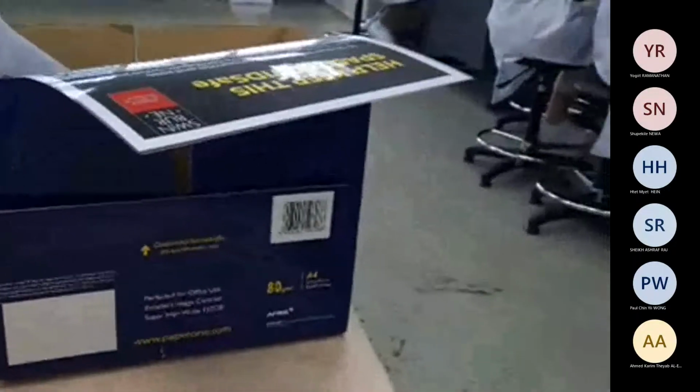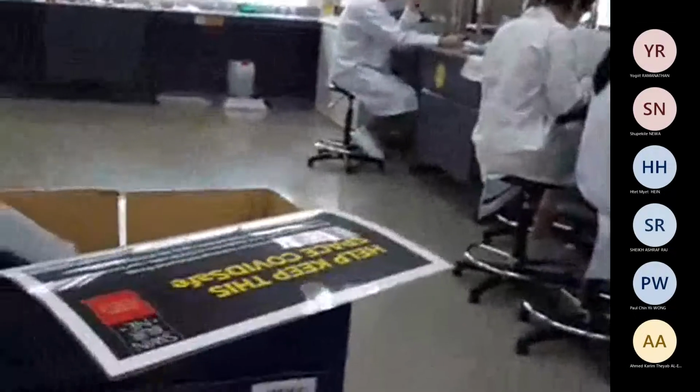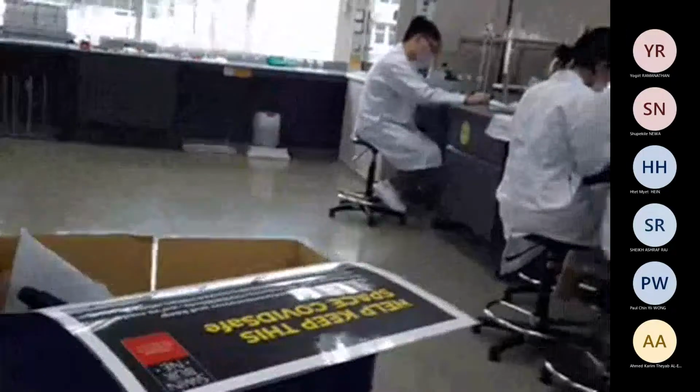Okay, so what we'll do is sodium salicylate. The salicylic acid will be produced. Actually, what is that? Sodium salicylate, right? Sodium salicylate is used as a painkiller, a mild painkiller sometimes. So we will find the concentration of the sodium salicylate in an unknown solution.